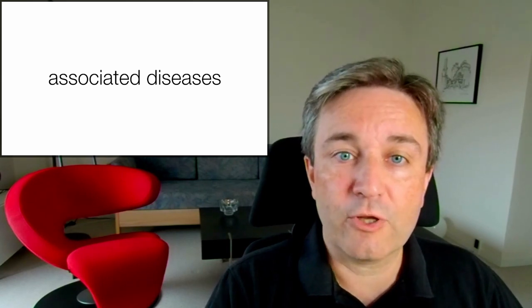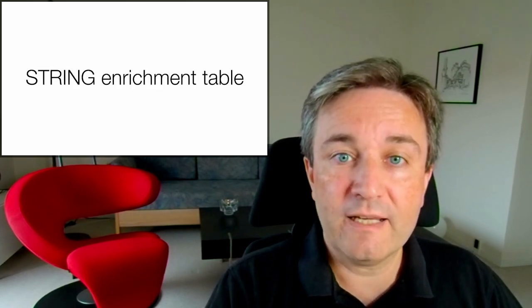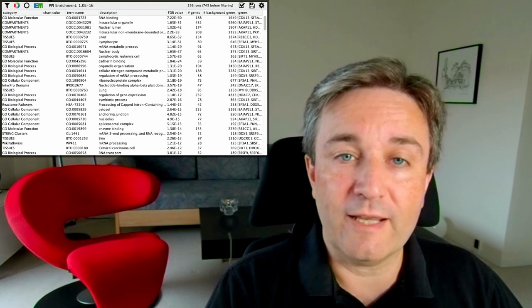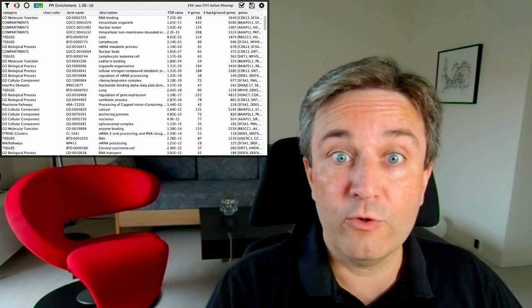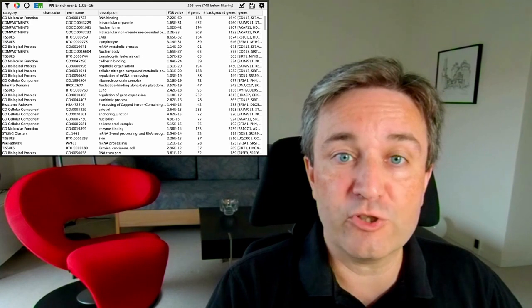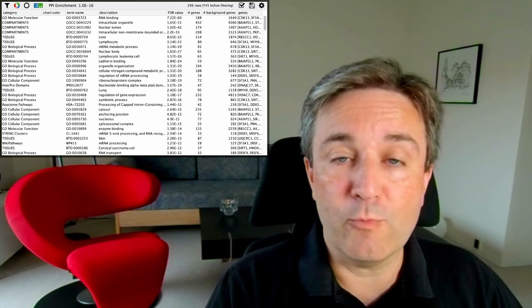All of these enrichment results are then shown in the StringEnrichment table, which looks like this. It shows all the enriched terms together with their false discovery rates, categories, and much more.